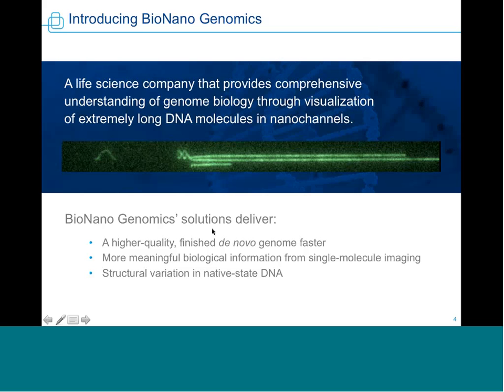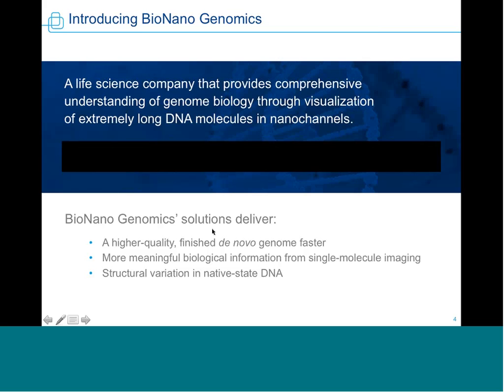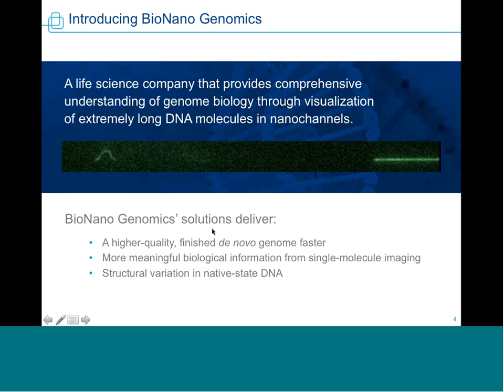So very briefly, the way you label your samples with the IRIS platform today is using nicking enzymes. And so we do a nick, label, and repair process. A nicking enzyme is a modified restriction enzyme. It recognizes a particular sequence. In our case, we use 7-base sequence nicking enzymes, and they cause a single-stranded nick. Polymerase then comes in and initiates strand displacement, and behind it, it incorporates fluorescent nucleotides.